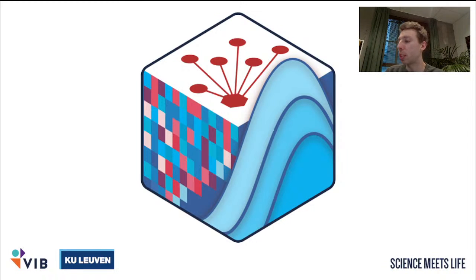Whether RSS is some kind of statistical test for regulons that are more active in a subset of cells. Yeah, so this is an entropy based method to calculate a specificity score, but it's not a statistical test in the sense that there is a p-value, or a cutoff you have to use on the RSS score to select your regulon. So it's not the best score for that.